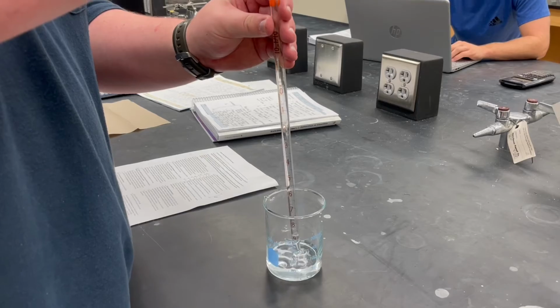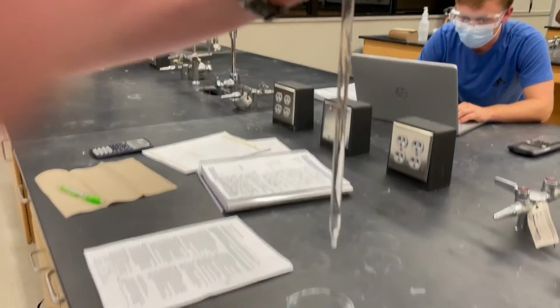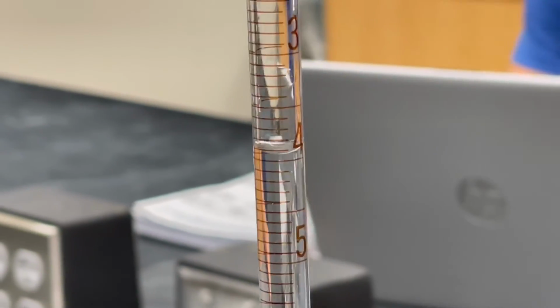Start by using a pipette to move over a certain amount of the stock solution into a volumetric flask. Using the meniscus, make sure to note the volume you originally drew up. In this case, the volume is around 3.93 milliliters.